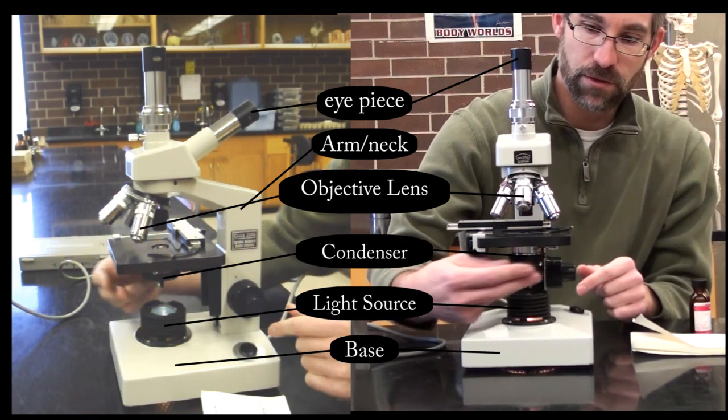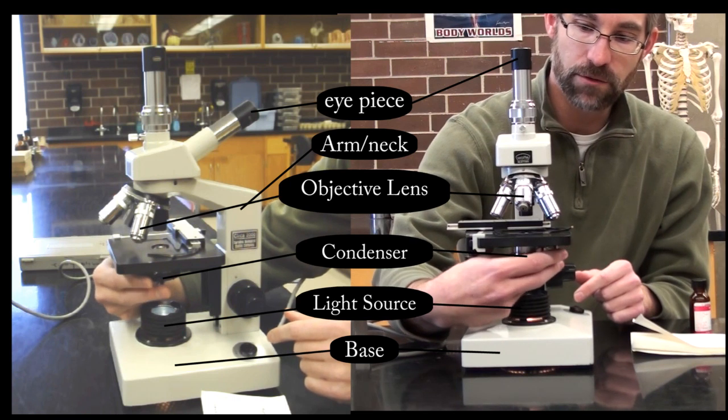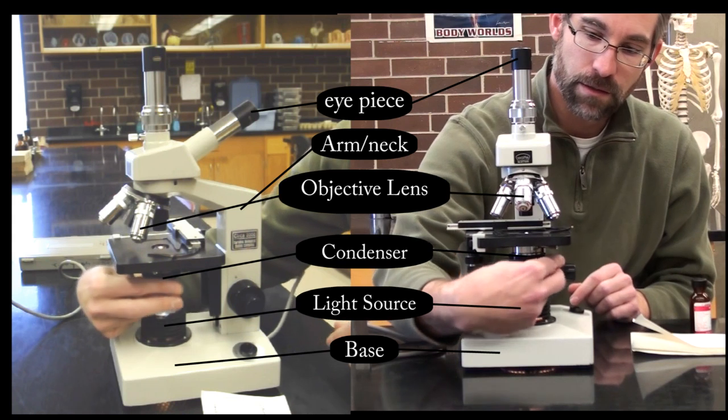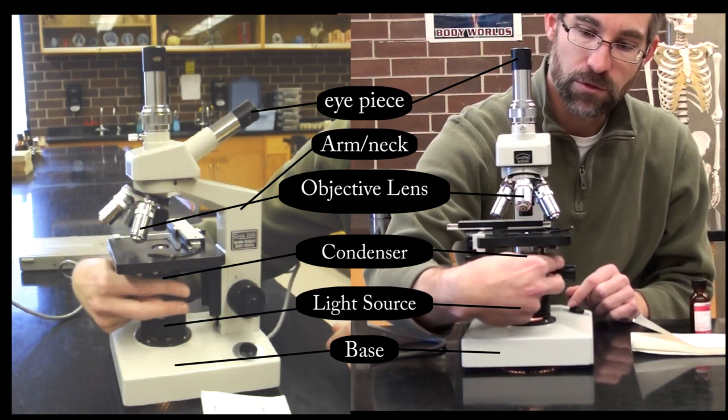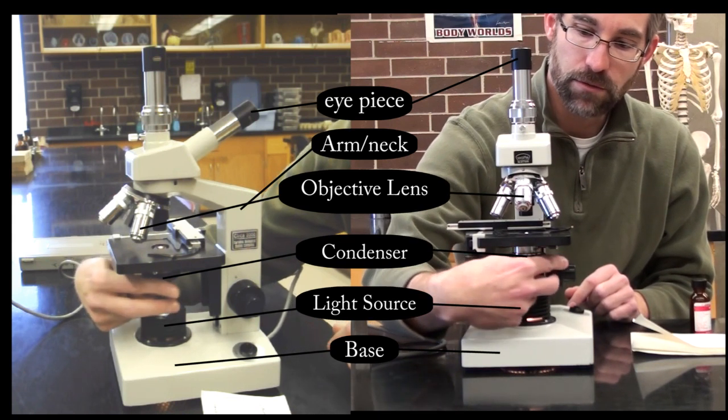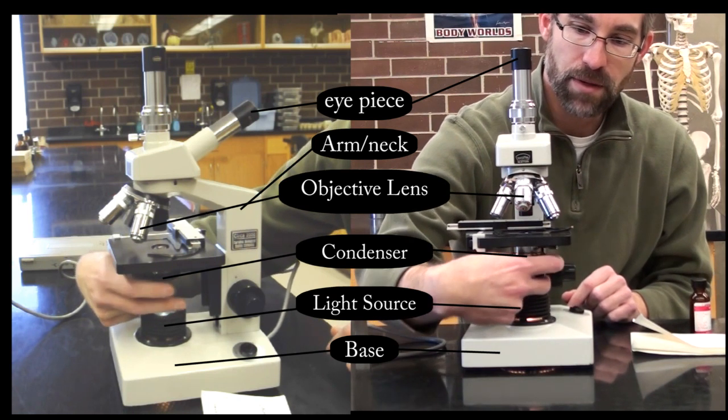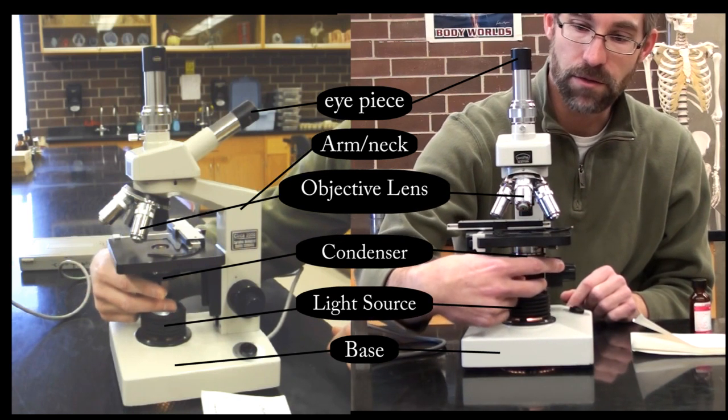With this condenser, we can adjust how much light goes through it by adjusting what we call an iris. We've got a little lever which will allow us to open and close and allow different amounts of light through. This will be important based on the type of lens that we will be using.